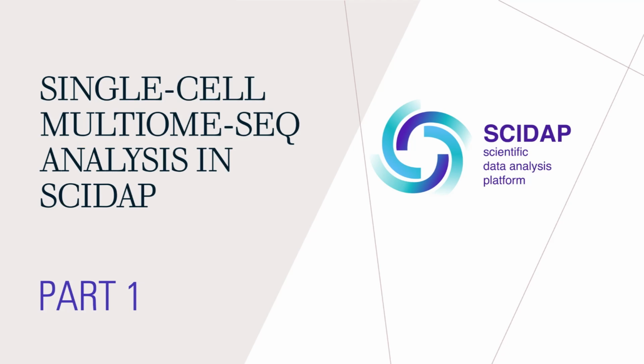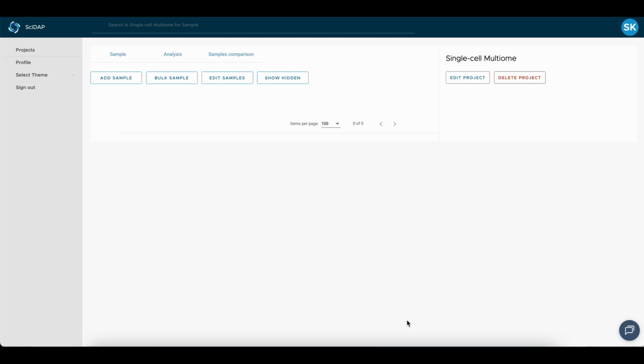Hello! In this video, I will demonstrate how to analyze your single-cell multiome data using SciDAP. Here I created a new project, and now we can add the pipelines to it.